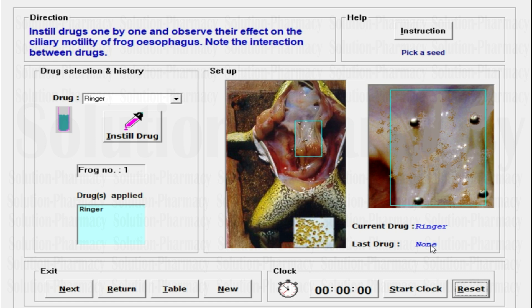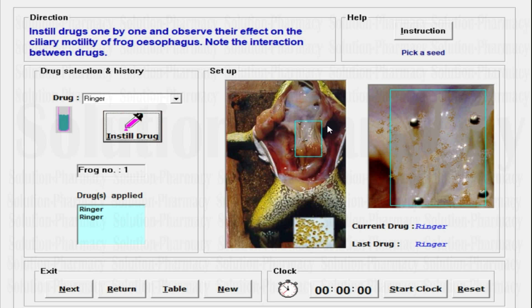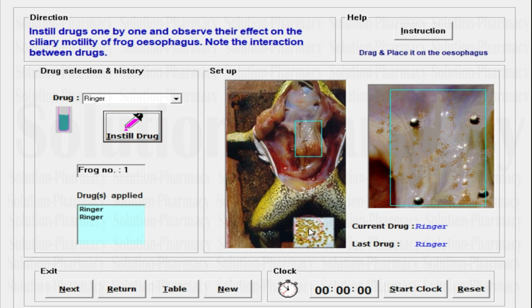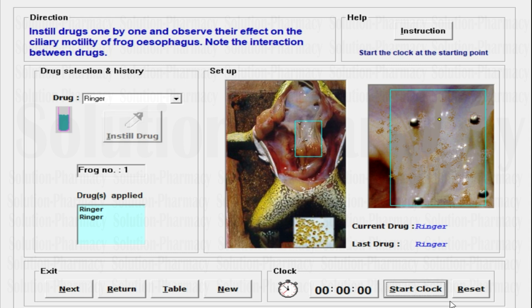Now let's begin the practical by selecting one drug at a time. First, I am going to select Ringer solution, then click on Instill Drug. Be careful and focused on your screen. Once I instill the drug, as you can see in the setup tab, the drug is applied to the esophagus. Now the instruction says pick a seed — just focus below on my cursor. There are seeds over there. Click the left mouse button and drag the seed toward the esophagus. After clicking, drag it and place the seed over the starting point, then release it. Once you release the mouse, immediately start the stopwatch — this is very crucial because time fluctuation may affect the reading.